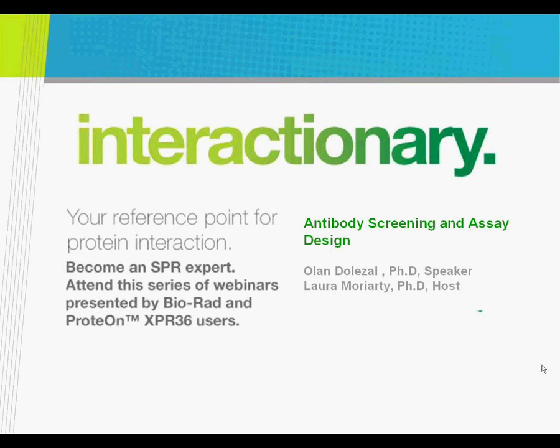So this is just a quick title. I'll be talking about essentially a kinetic screening of antibody fragment libraries using the ProteOn instrument. I should add that some of these assays were initially developed on a Biacore instrument, so there'll be some initial experiments that were done in Biacore.